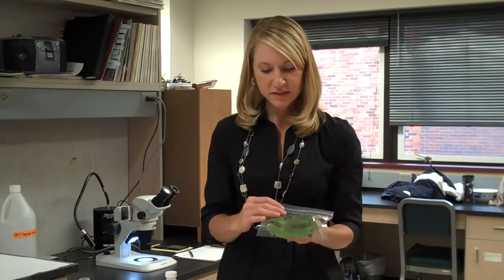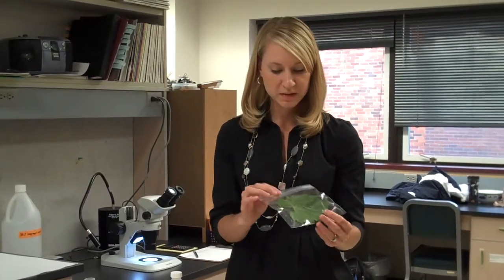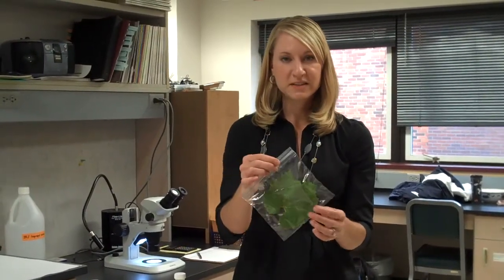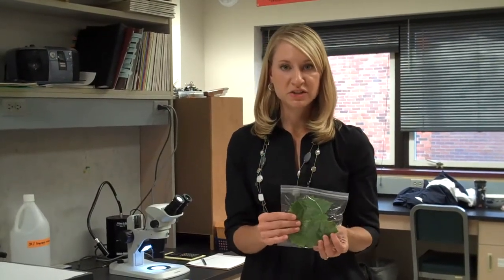During late summer I went out and collected some leaves in the vineyard from the mid canopy and upper canopy, locations where the rust mites tend to be. I took some plastic sandwich-sized ziplock bags and collected each leaf individually in a bag. The reason for putting it in individual bags is to allow for isolation of whatever population of insects might be on that leaf for later quantification in the lab.